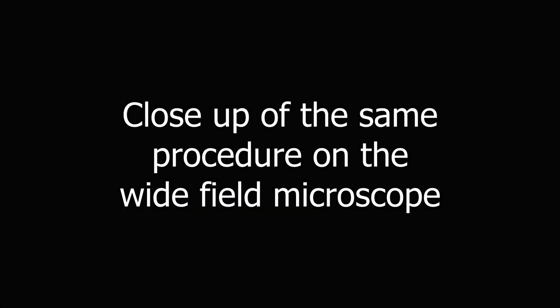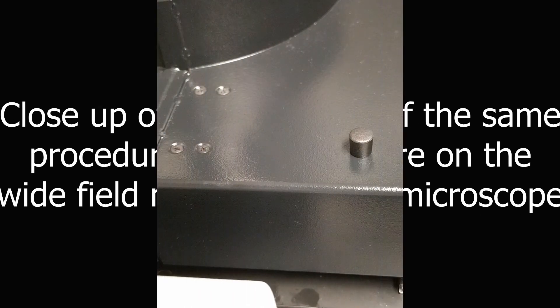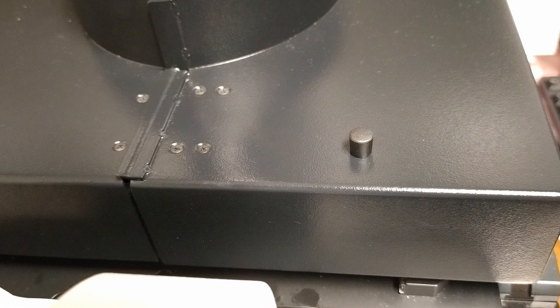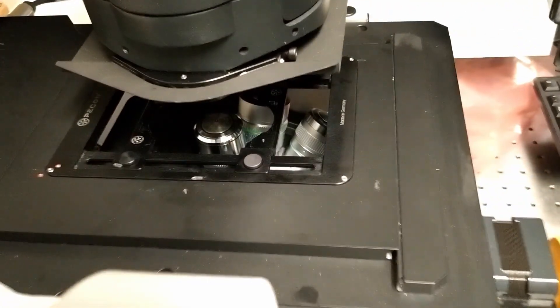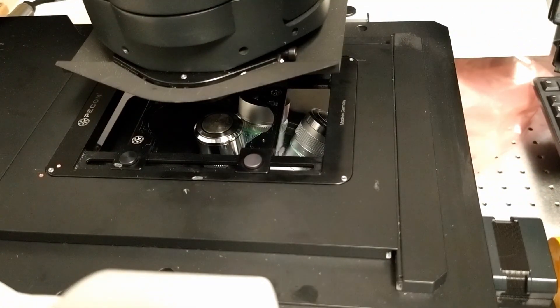Now we're going to watch a close-up shot of the same procedure on the wide-field microscope. This microscope has a laser safety box around the condenser, which you need to open, and then tilt the condenser arm back.